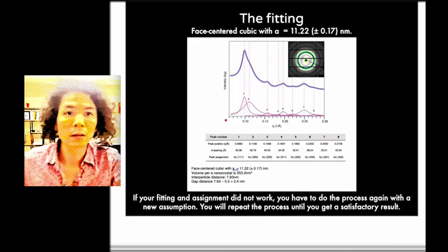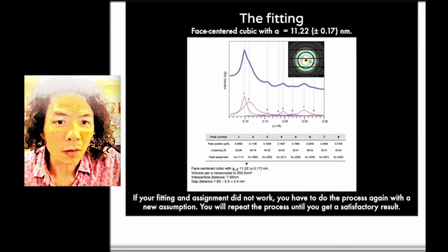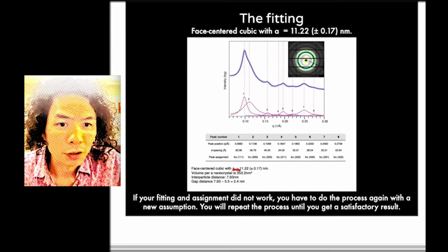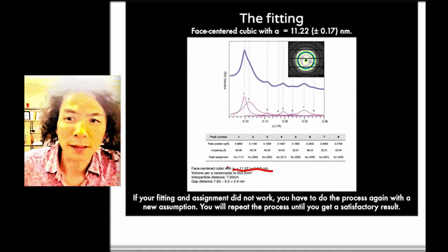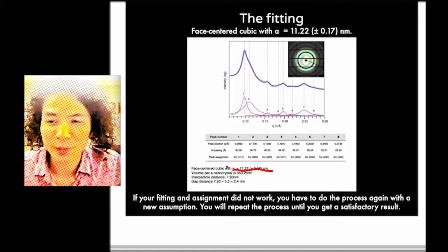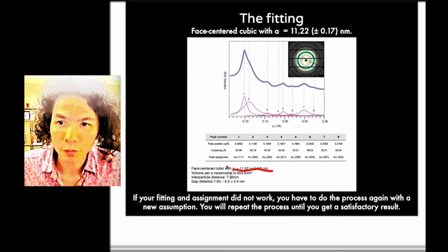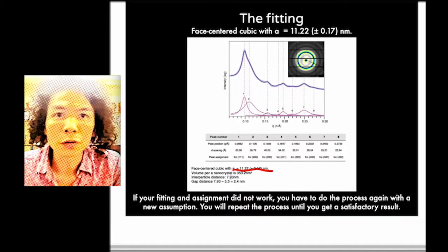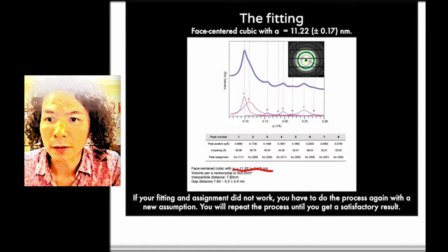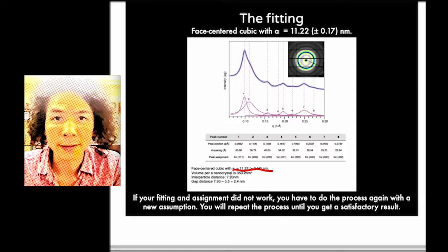And in the end, you can have the optimal A structure like this. So basically this is the idea. It's pretty simple. Just the calculation is a little complicated, but if you go one by one, you should be able to do it by yourself. So that is why today I'm going to show my Excel sheet, how I calculate and how I do the optimization here.